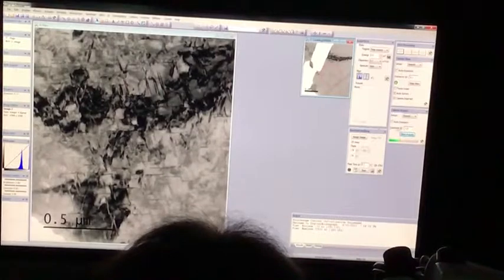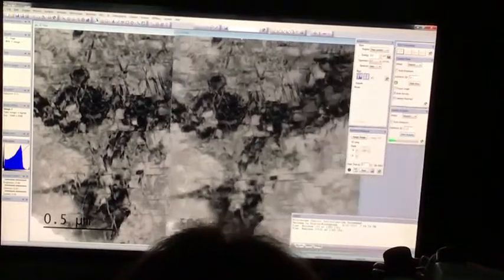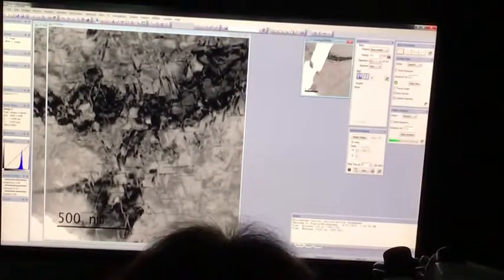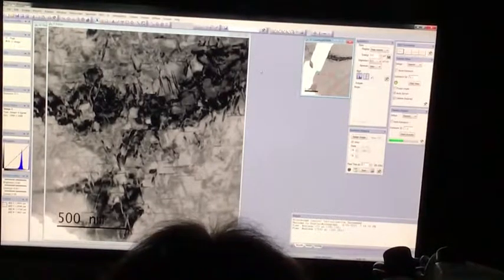So quiet. I've actually shifted the region of interest slightly. I'm going to go back to this image. It's actually over here now, down near this point. So that's good. So I'm going to save this again.